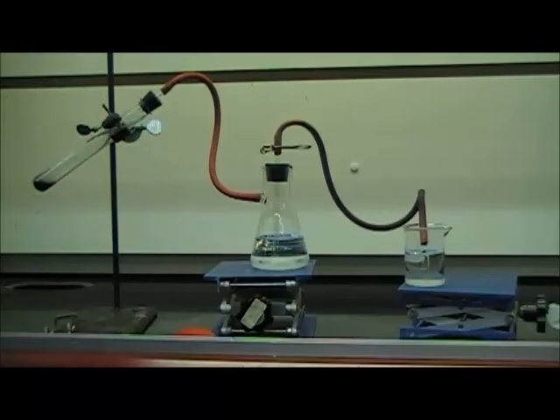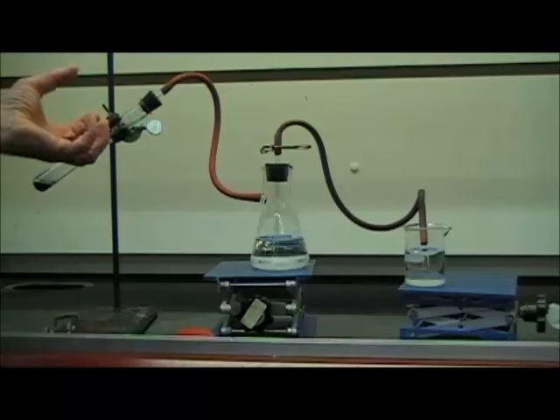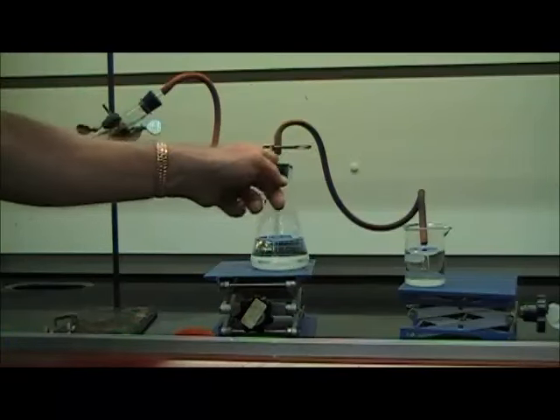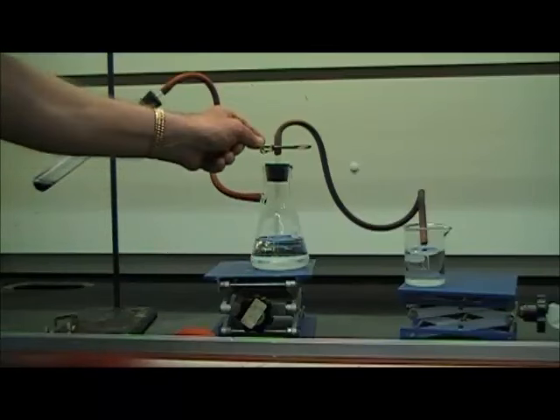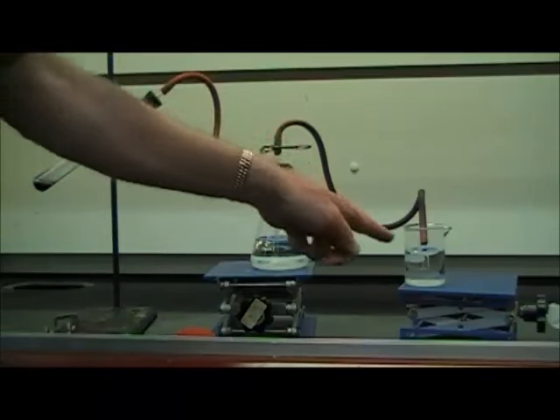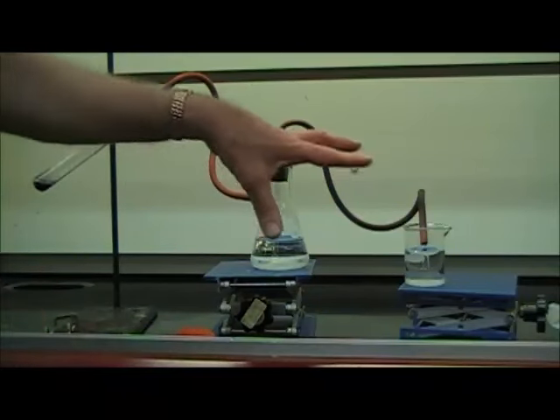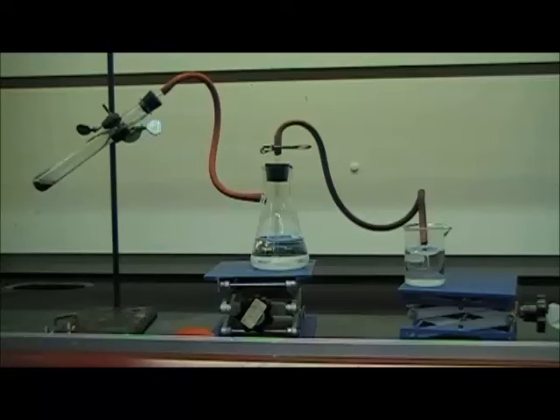What we need to happen is for the temperature of this part, which is very hot since we've been heating it, I need that to cool down to room temperature. So this is where you just sit and you wait. And as that's cooling down, of course, as the gas cools, the pressure decreases, water will be suctioned back over this way. So you need to keep the clamp so that it's not clamping off the tube. You actually want water to flow back over to the point where the whole apparatus is at room temperature.